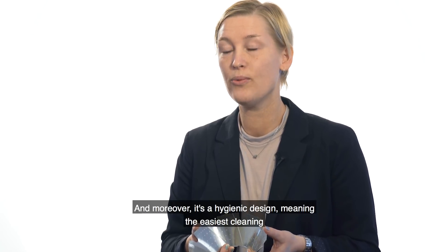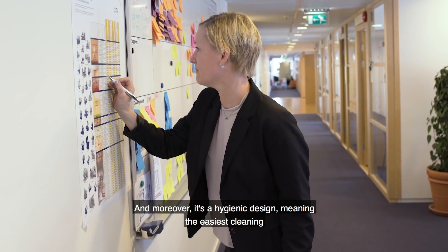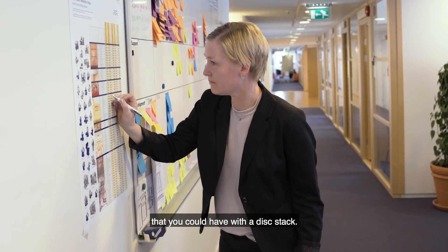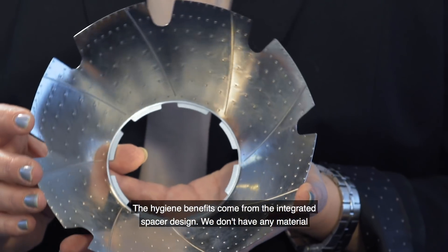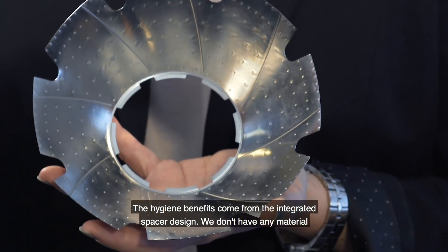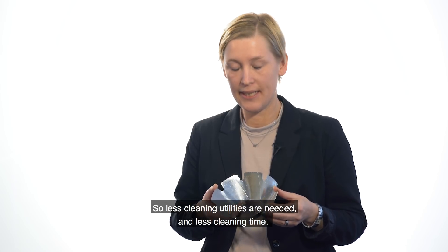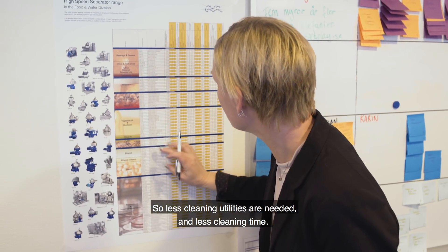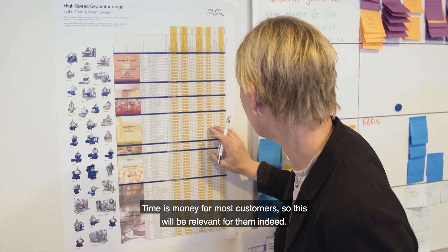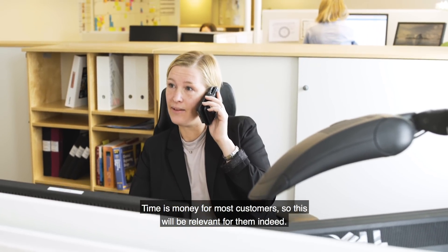Moreover, you will have a hygienic design, so you will have the easiest cleaning possible with the disc stack. The hygiene benefits come out of the integrated design — we don't have any material welded onto the discs, so less cleaning utilities will be needed and less cleaning time. And time is money for most customers, so this will be relevant indeed.